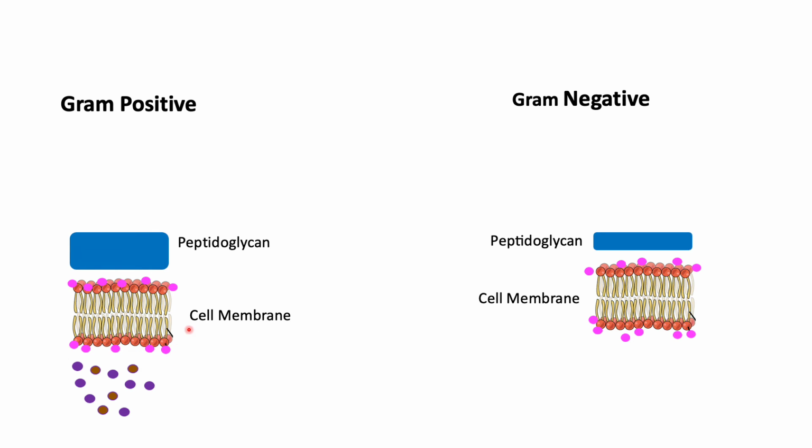Now, after we've added in these safranins, we can make an educated guess. We can say, okay, if we were to look under a microscope and I saw only pink, would it be gram-positive or gram-negative? Well, we would think that this one has pink and it has purple. So what color is going to show up? I would say purple is going to show up because purple masks the color of pink, right? And this one, gram-negative, only has pink.